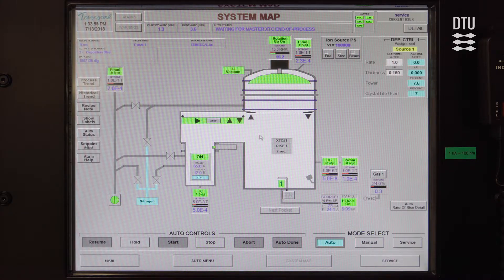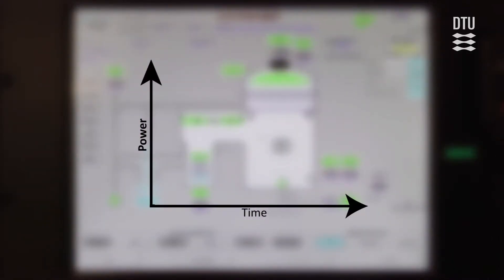So when we start the deposition, we first increase the power gradually so that we can increase the temperature of the material gradually. So we have a rise and a soak to increase the temperature somewhat. And then after soak one, we will have another rise and another soak where we are closer to the evaporation temperature so that we get the evaporation started before we open the shutter.